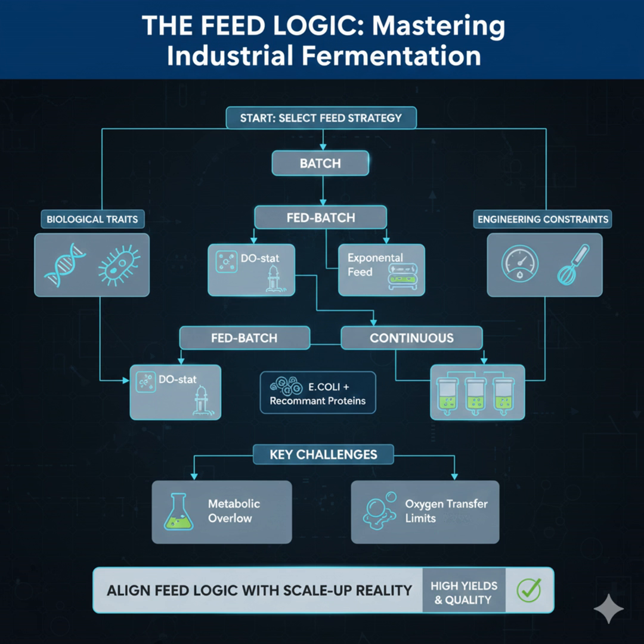Okay, let's unpack this. We are diving deep today into what might be the most mission-critical decision in all of bioprocessing, and that is selecting the feeding strategy. If you've ever operated a bioreactor, you know this tension. You're trying to keep your cellular machinery maximally productive, but you're also trying to avoid all the things that make them cranky. Too much sugar, for instance, can lead to stress, toxicity, and ultimately a useless product.